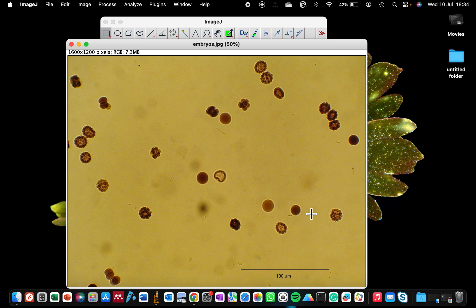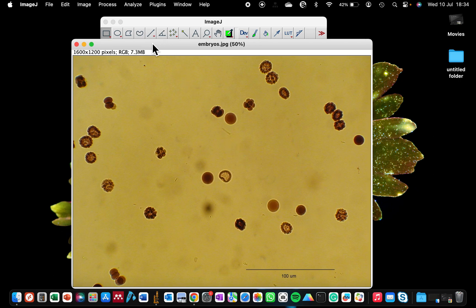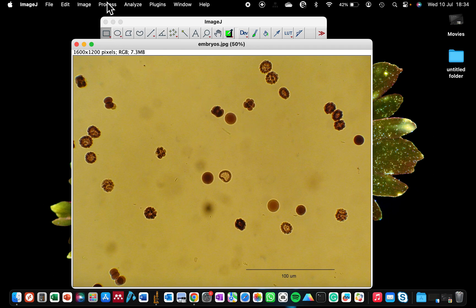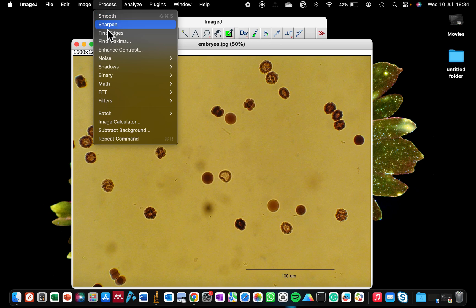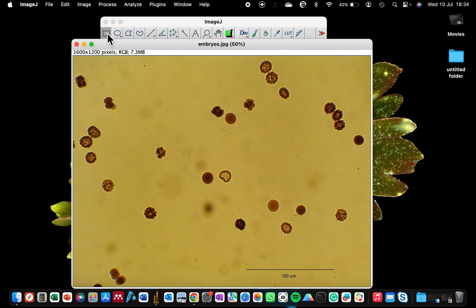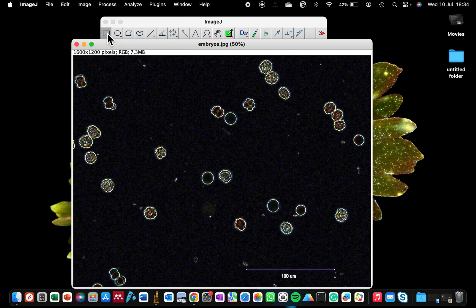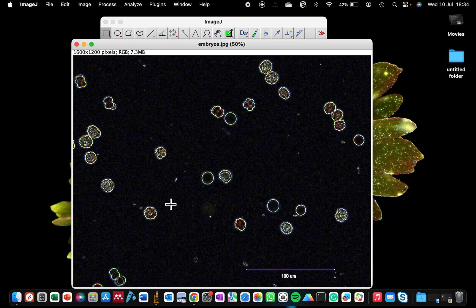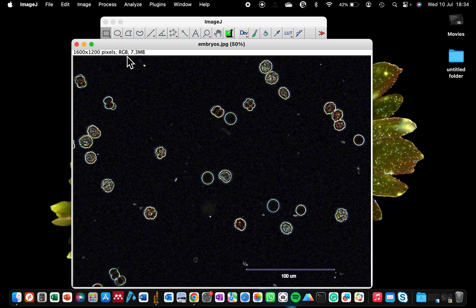Let's say, for instance, we're interested in shading only the intact cells. What we are going to do is click after you've opened the image you want to work with. First, let's tell ImageJ to find the edges of each of these cells. To do that, we go to Process, select Find Edges. So if you select Find Edges, you see that it has transformed this image. This particular image, because it's still in RGB format, we can see the edges of each of the cells glowing with a black background.